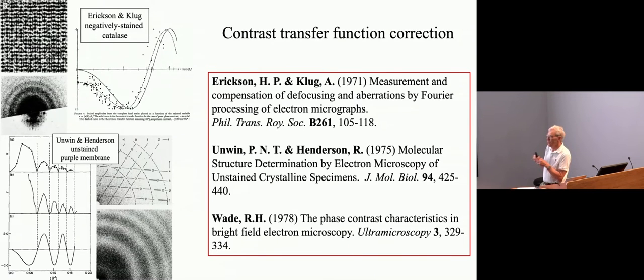So from the phase shift of scattering of electrons, its pure phase contrast gives you this curve, but because it's negatively stained and they have a lot of heavy atoms in them, a proportion of the beam is actually scattered outside into the column or into the objective aperture. And so you get quite a large amount of what we call amplitude contrast, about 35% of the peak of phase contrast, whereas with unstained structures, it's much less here, maybe 5 or 10%.